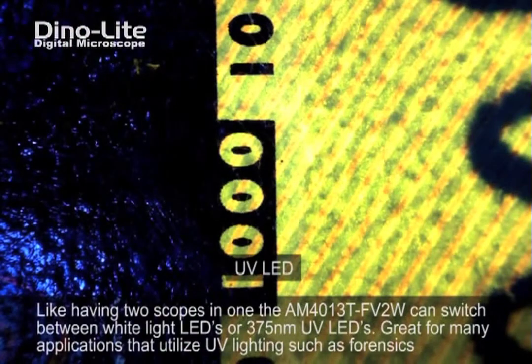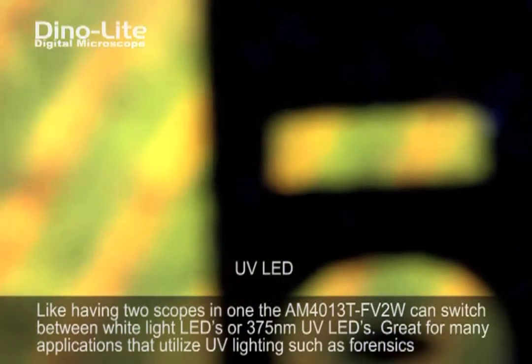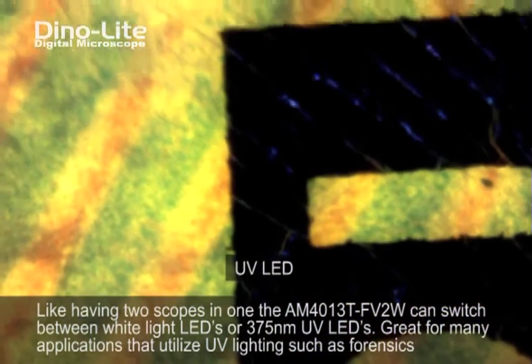Our newly enhanced UV filtering system provides improved fluorescence contrasting for use within the biochemical field, forensics, and or machine vision, to name a few.